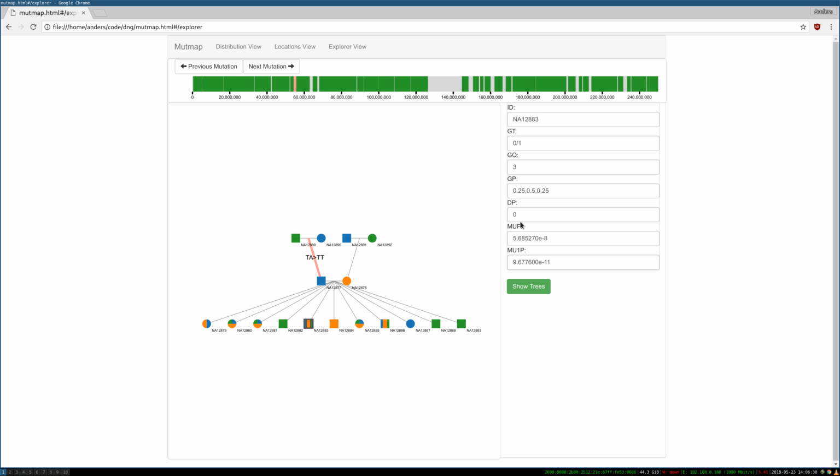And you can see that that's borne out in the GP here, which shows the probabilities of the different types of breakdowns. And that is defined again in the VCF spec. So that just gives you an idea of the different things here.